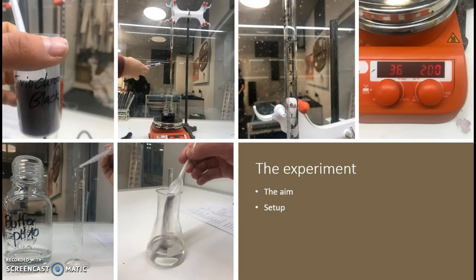So we set up this experiment. Here is the complete setup with this beaker with tap water, 10 milliliters of tap water, and some buffer. Buffer has a pH value of 10.